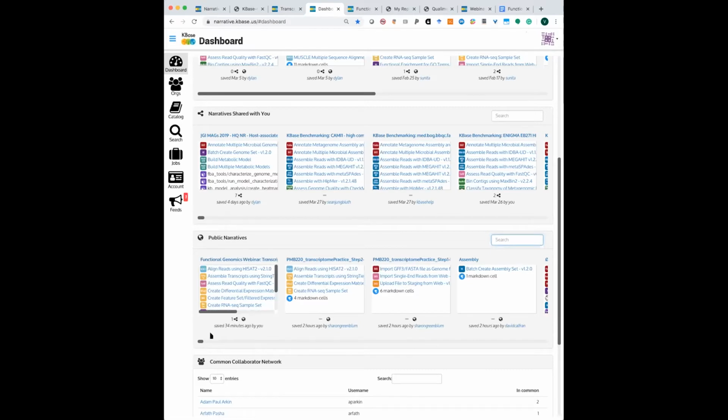Also it's first in the list because it's the latest updated. So it's actually going to be the first narrative in the list that you'll see under the public narratives section.